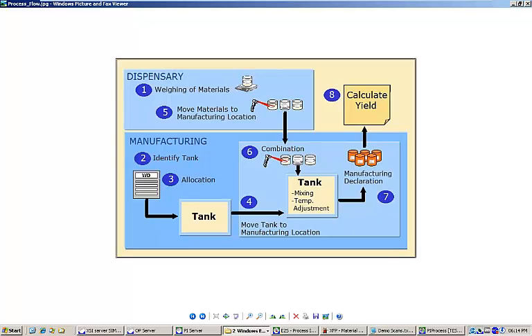Let's review the process flowchart. We've already completed step 1, weighing of the materials. Next, the EBR will direct us to identify a compounding tank, allocate it to the work order, and move it to our compounding location. We will then be directed to move our weighed materials to the compounding location and begin combination in the tank.